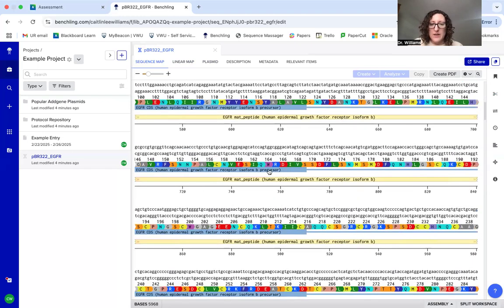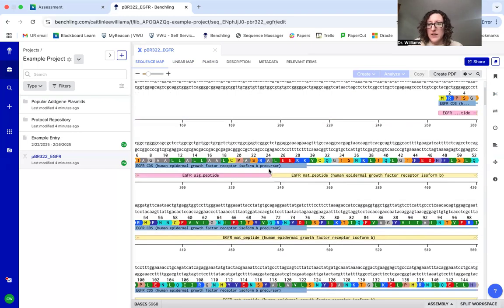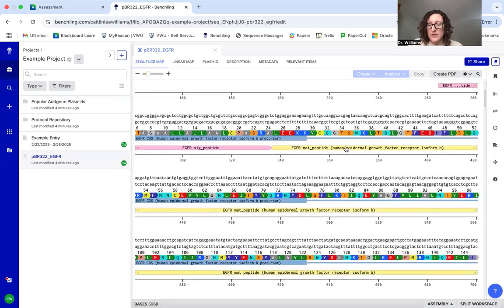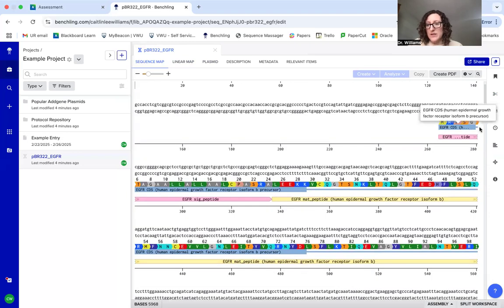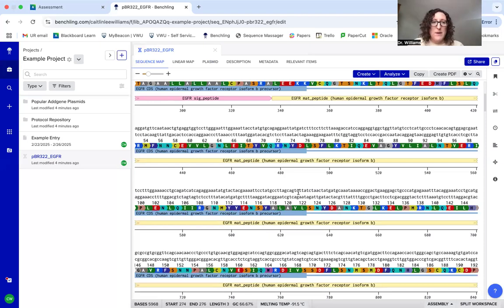And then this has a gene annotated for you with these boxes that are colored, and it has the name of the gene there. And then it also has the protein sequence on here as a translation. And what's cool about this is you can click on each one and the codons will appear. So that will be handy dandy later, as you guys go and figure out what your mutations are and what they mean.